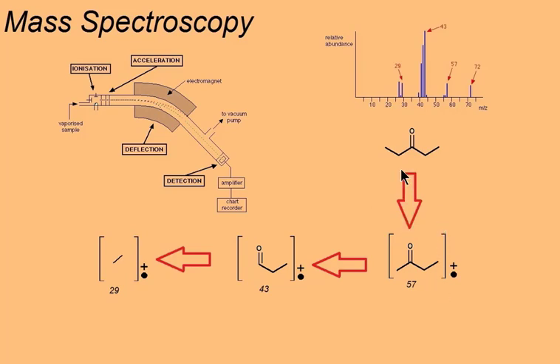So when the chemical bonds fragment and break, it's normally the bonds which are polarized or bonds next to polar bonds which break. Classic example here, a carbon to carbon bond just adjacent to the functional group, that polar carbon to oxygen bond in the molecule.